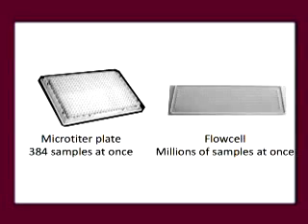Why don't you do the PCRs in tubes? You can do a lot of PCR reactions in a microtiter plate. This is a very different scale. Even in the best microtiter plates available, we could only do 384 PCR reactions at once. In the cluster generator, we can attach 200 million pieces of input DNA over the surface of the flow cell. Because the DNA is spread out and attached to different positions, a different PCR reaction occurs at each separate position.